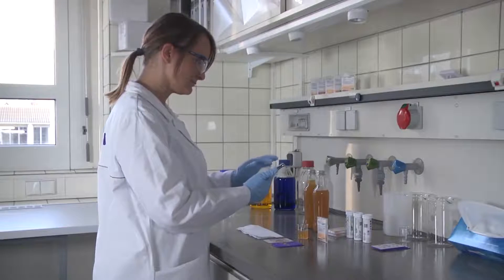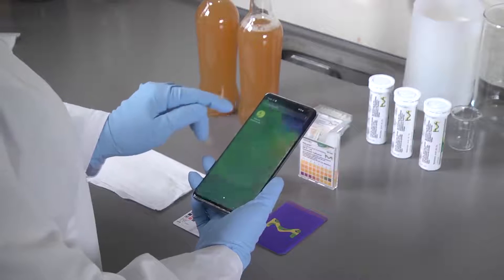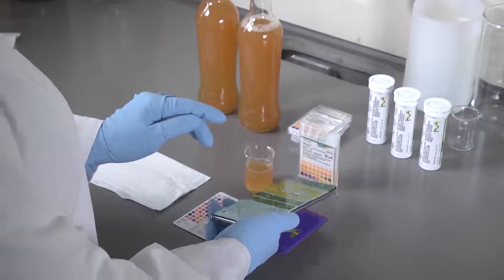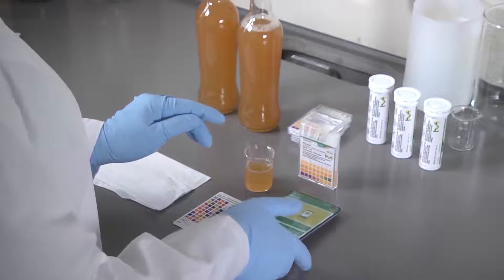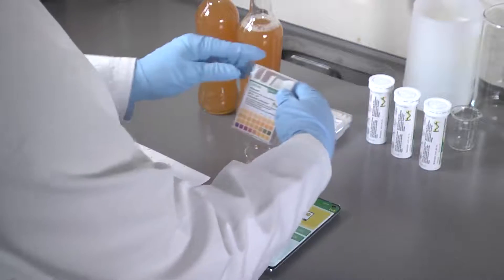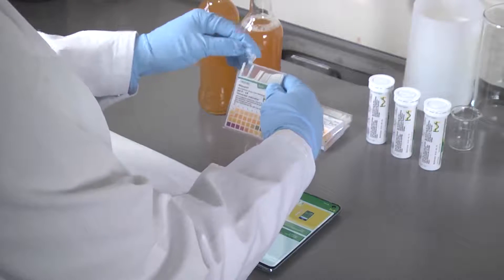To carry out a measurement, open the app. Have your mQuant test strips and reference card ready. Take an mQuant test strip out of its box.